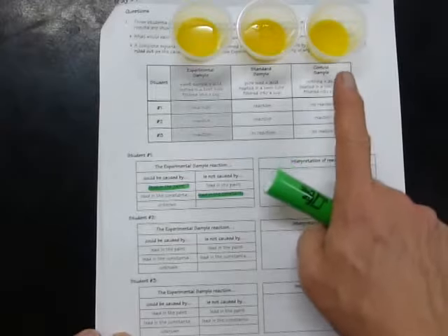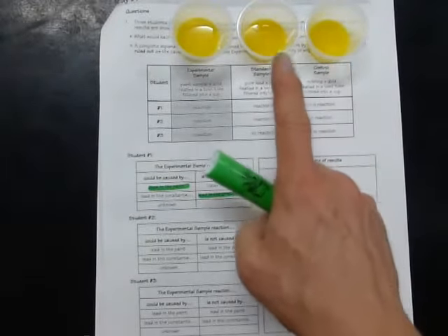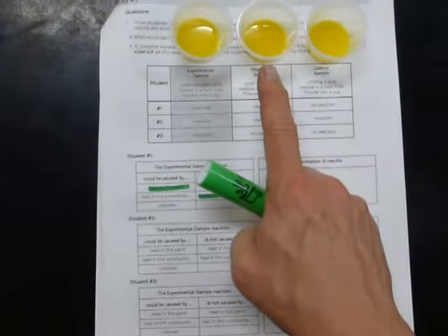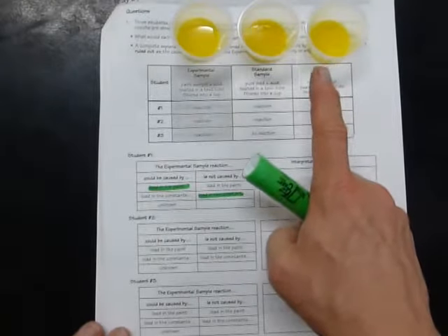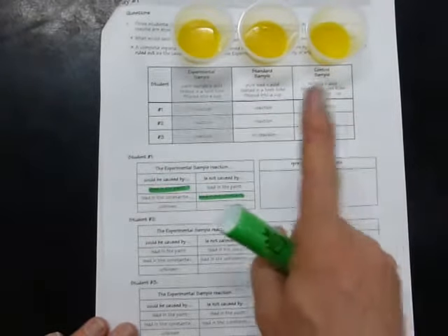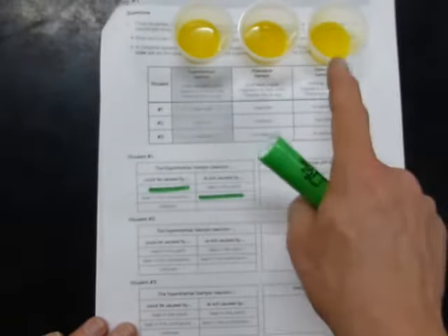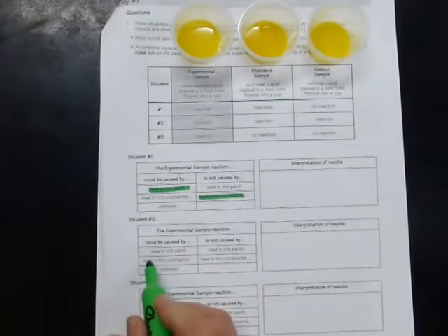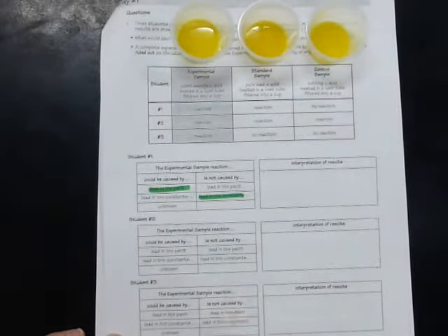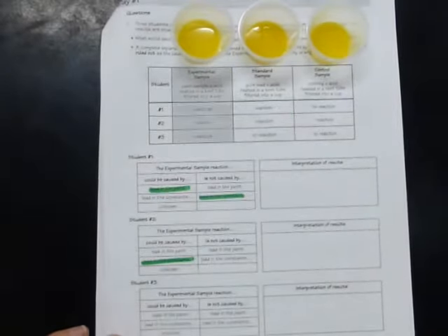Well, I'm looking over at the control and I see that there's a reaction. That means that there's something in there that reacts the same way as the lead that was put into the standard. Since the standard and the control are both made identically with the same materials except for one thing that's different, this one has lead added to it, they both react the same way. That must be because there was lead in the constants. So if there's lead here in the constants, then that's a possible explanation for the reaction in the paint sample.